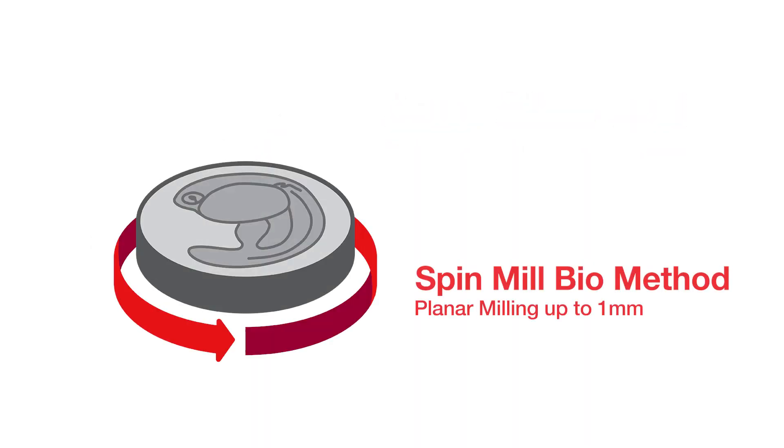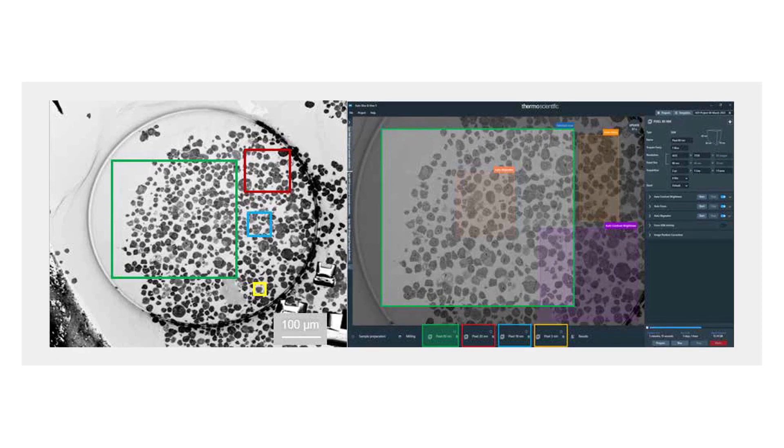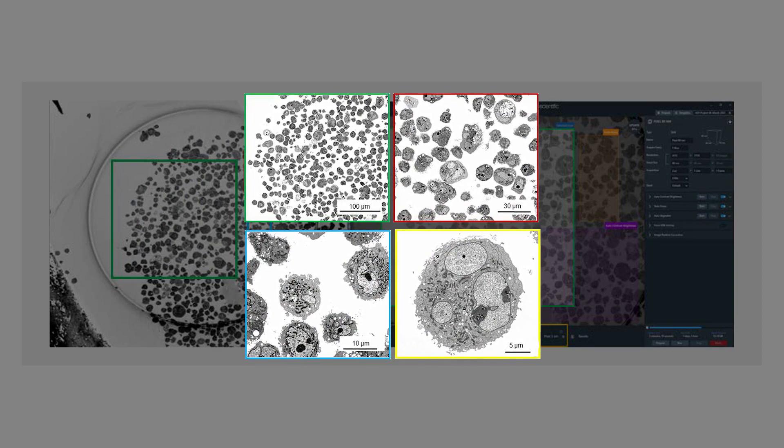Using the Spin Mill Bio method, serial planar milling can expose large sections up to 1 mm in diameter. Multiple areas of interest are then specified for imaging within the larger slice area. In the case of samples with sparse features, multiple regions can easily be imaged, saving time while allowing the acquisition of statistically relevant 3D data.